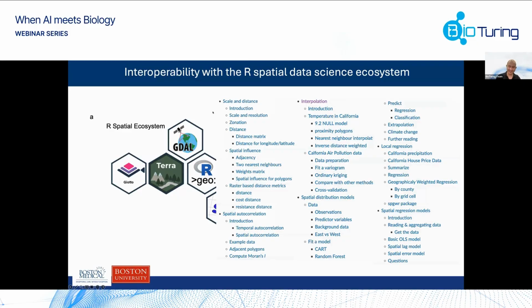And I just want to show a quick example. There are many of these tools that have been vetted and implemented already for decades. And we were thinking, how easy would it be to use some of them, and are they useful? I think the answer is obviously yes, but we want to show what we can do. And so in a matter of a week, I think we just built something based on interpolation. So hey, let's use interpolation.